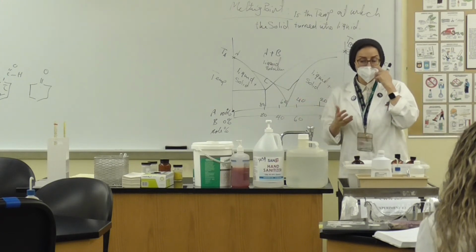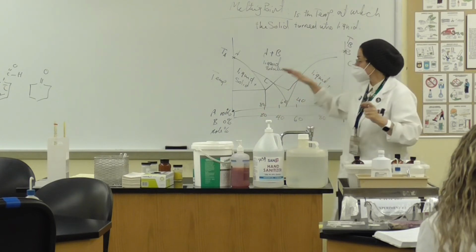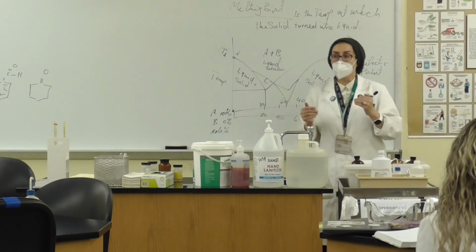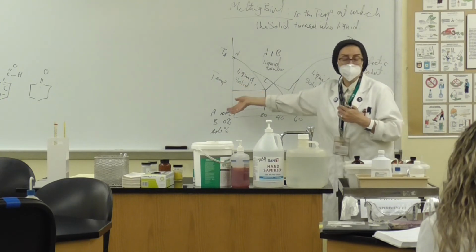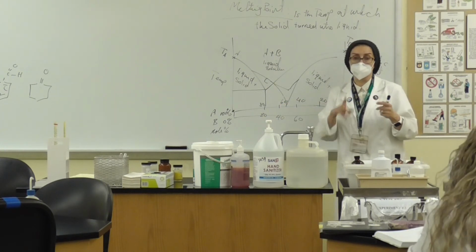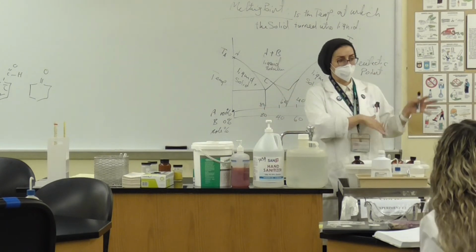So the purpose is that we are going to measure them when they are pure, versus when they are a mixture. Let's say we prepared a mixture 50-50, and we're going to compare the pure melting point and the melting point of the mixture. So this is another study that is going to help us know whether our chemicals are pure or contaminated.